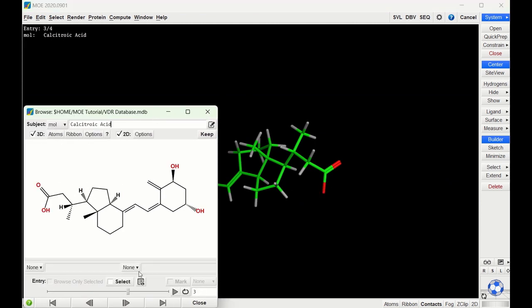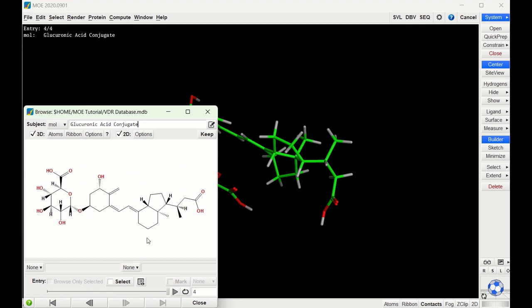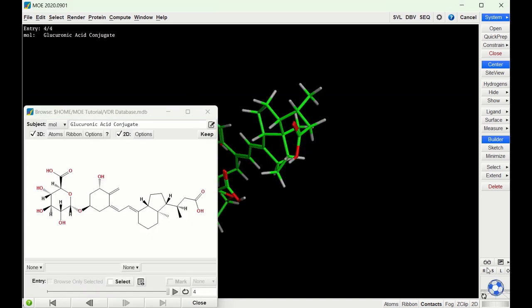Lastly I have the glucuronic acid metabolite of calcitroic acid drawn — so this would be a phase 2 metabolite of calcitroic acid — and you can see it has a molecule of glucuronic acid put onto one of the OH groups there. And you can see what that looks like in MOE.